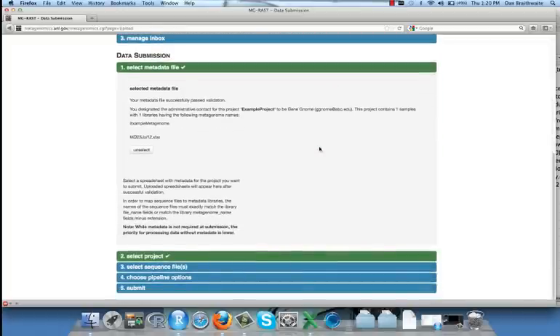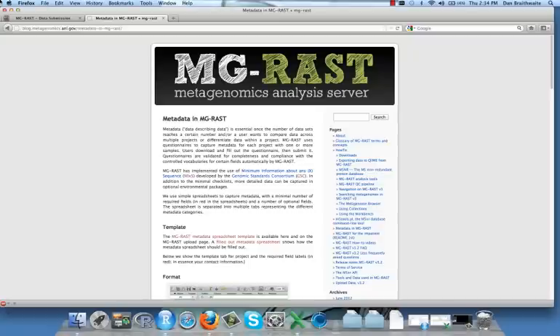The information in this video is also available in print on the MG-RAST blog page addressing metadata. You can also download a completed example spreadsheet from that page.